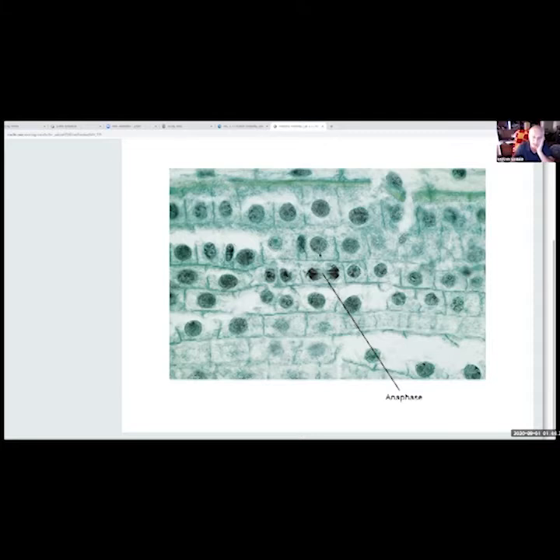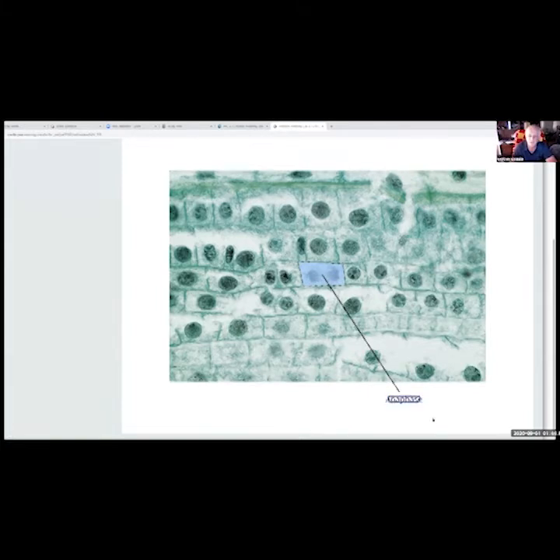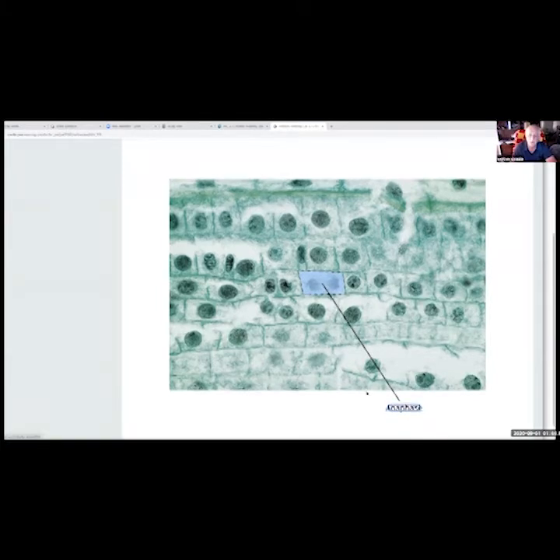That's a test one right there. That's when I would put on a test and say, what is that? Because there's no doubt about what that is. Okay, it's past prophase, it's past metaphase enough, and the things are starting to separate, but they haven't started pulling apart all the way to the cell yet. The cell hasn't had any cleavage. Okay. Anaphase. I even told you it's anaphase. I click on it.